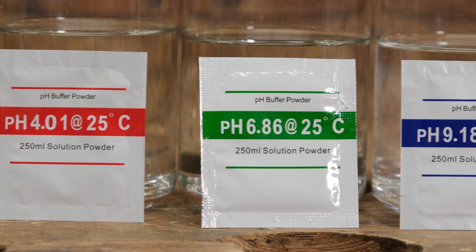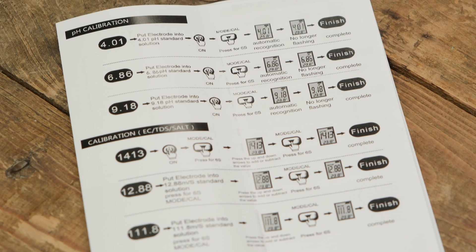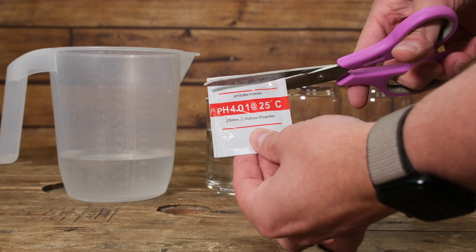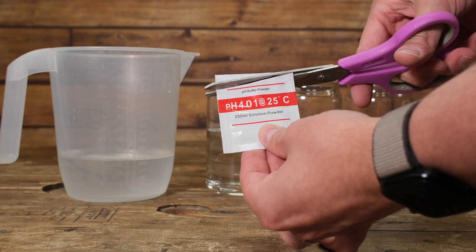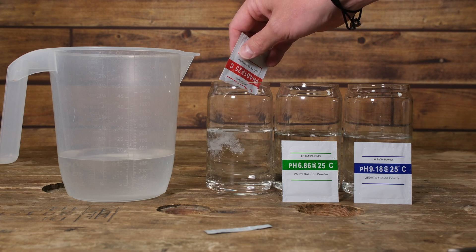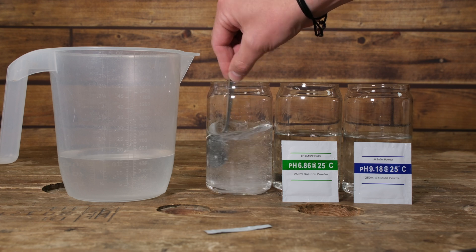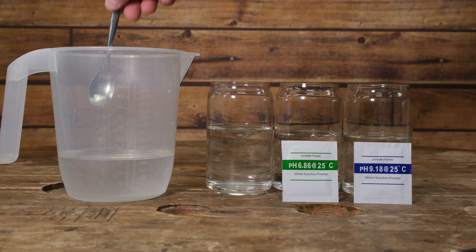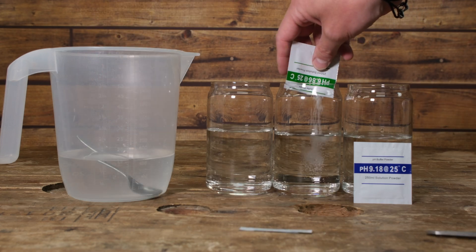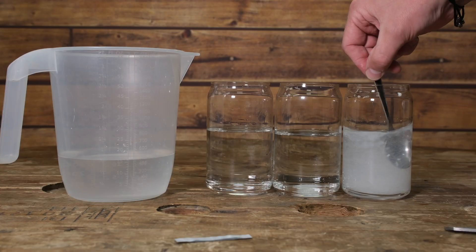Line up the pH buffer solutions in the order we're going to use them. It's important to read the instructions for your particular pH meter as some will vary in the calibration process. Ours is relatively simple — you start with the lowest pH buffer solution and work your way through to the highest. We start by cutting open the bag for our lowest buffer solution, in this case 4.01, and pour it into our distilled water, giving it a really good stir to dissolve all the powder to get an accurate reading. Give the spoon a quick rinse in distilled water, then mix up the middle buffer solution which is 6.86, and finally our higher pH solution which is 9.18.